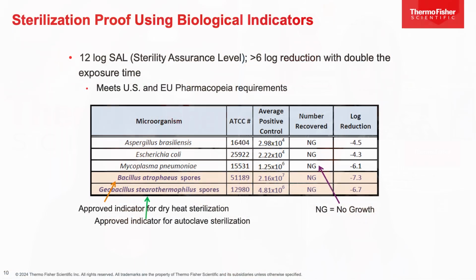As one example, I've recently seen a new white paper from a manufacturer that claims 12-log sterility assurance level, but those guys used vegetative, actively growing versions of those bacteria, and they're not heat resistant. So as always, any automated system should be tested and proven effective. Yeah, I agree. I mean, proven sterilization certainly would provide peace of mind, especially since we already said that an incubator is a great place for microorganisms to live, as well as for tissue cells, right?